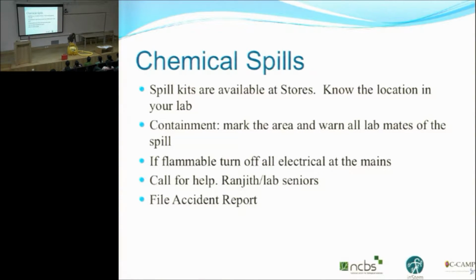Inside a chemical spill kit, lots of absorbent material, okay? Many pads. Also, which I think is fabulous, is they also have heavy-duty gloves, a mask, goggles, as well as bags for collecting the waste you will generate when you absorb chemical that you've spilled. But you are all new here. Please consider getting help. But you should know what a chemical spill kit is.